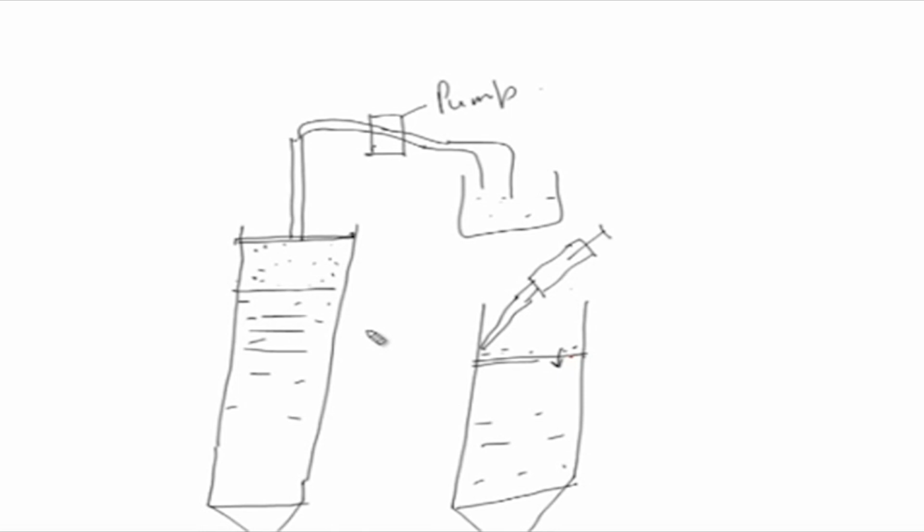Another method is to use high density solutions: you can use sucrose or glycerol in your sample, which gives it high density. Then you do not have to remove the mobile phase, because you can put the material in while the mobile phase is there, and since it has high density, it will settle in without any problem. So, these are a few ways you can do it, for example for high concentration protein solutions, which are quite dense.